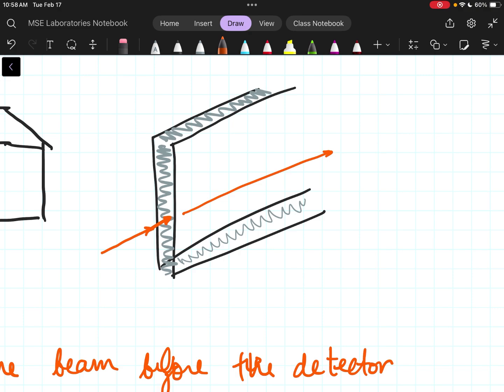What does that mean? It means that it was perfectly parallel. Let's say I have something that is not perfectly parallel with this line. It may enter this gap between them, but it's going to end up running into my back piece of foil.